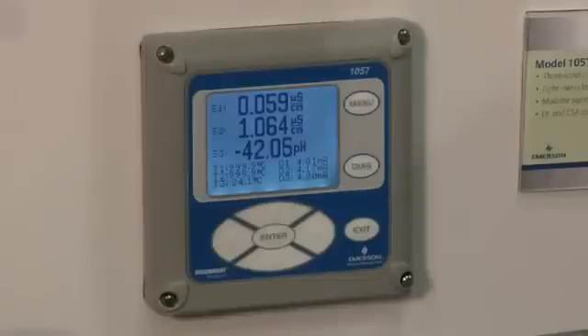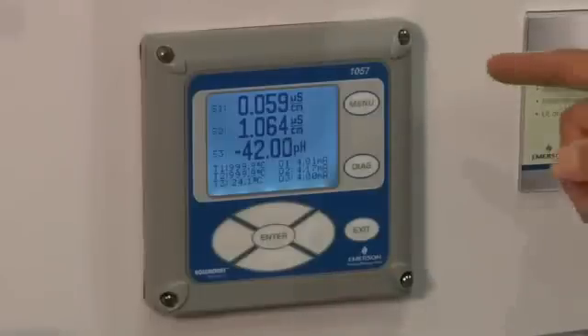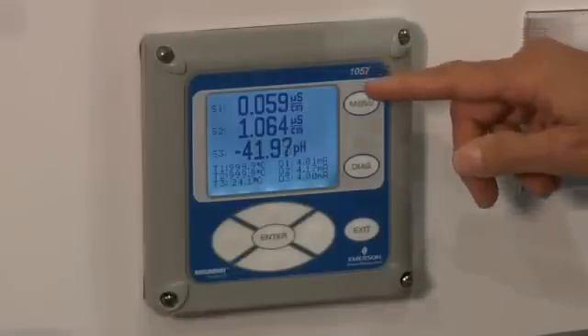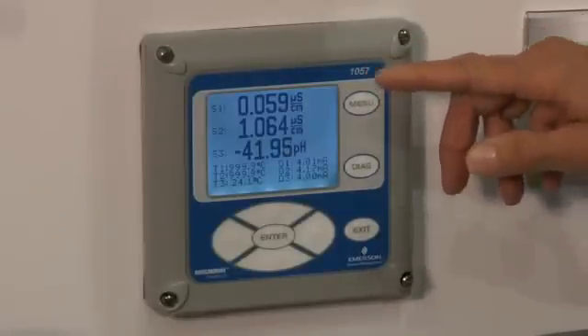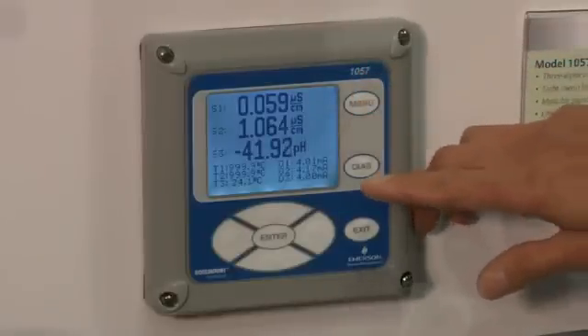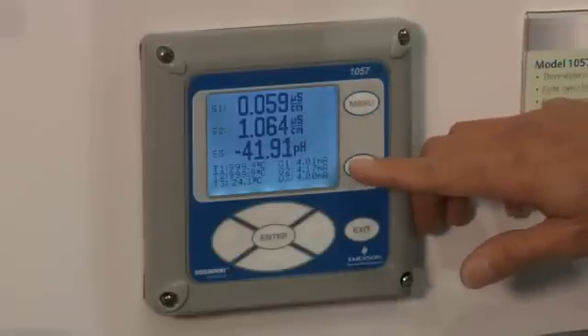The first feature of the Model 1057 I'd like to show you is the large display, which shows the live variables of the unit. The unit shows up to three live variables of live pH or contacting conductivity, and some other variables that help the user understand the process condition of the analyzer.